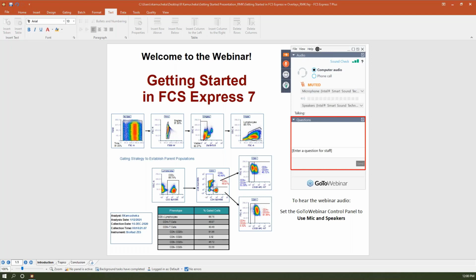So I'm going to get started with just a little bit of background information about Denovo Software. Our company has been providing analysis software for over 20 years. We have application specialists and distributors throughout the world, and our headquarters is located in Pasadena, California. Our customer service is exceptional, and we really want you to get the most out of your use of FCS Express. We usually respond to questions within a couple of hours when you write into support, and we're always willing to do one-on-one trainings and screen shares or group trainings just to make sure that you're getting the most out of your software.